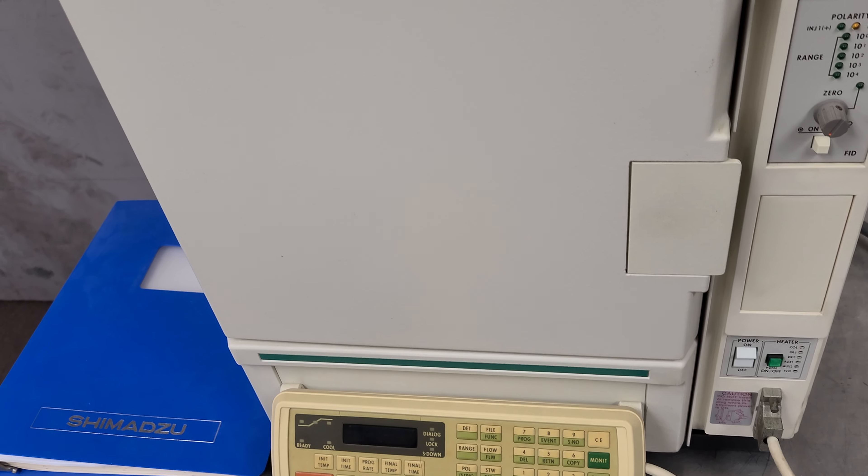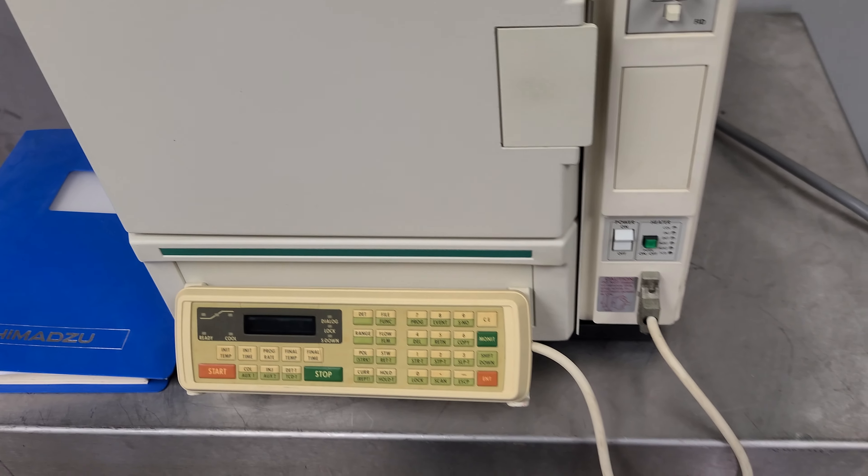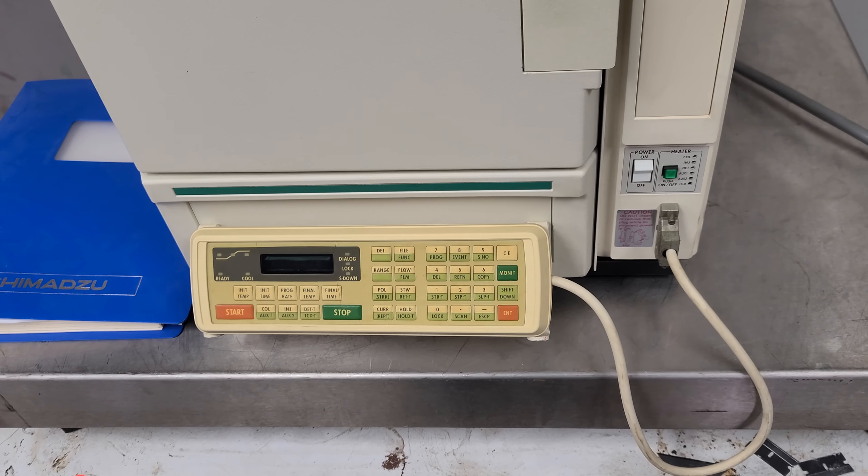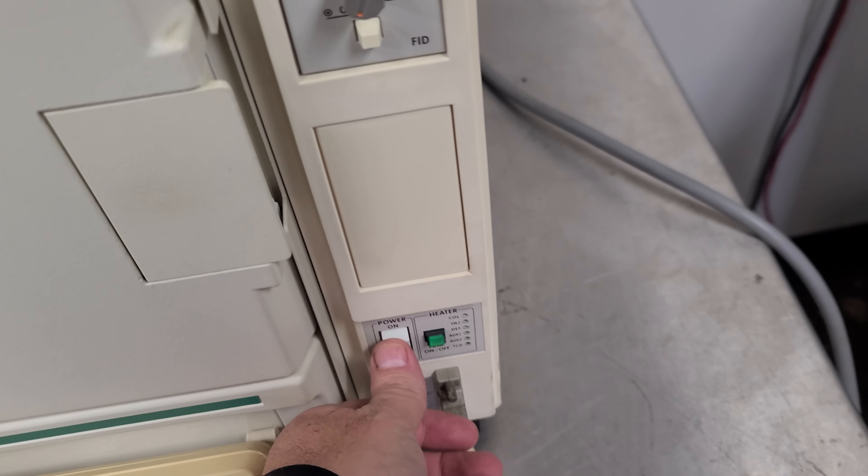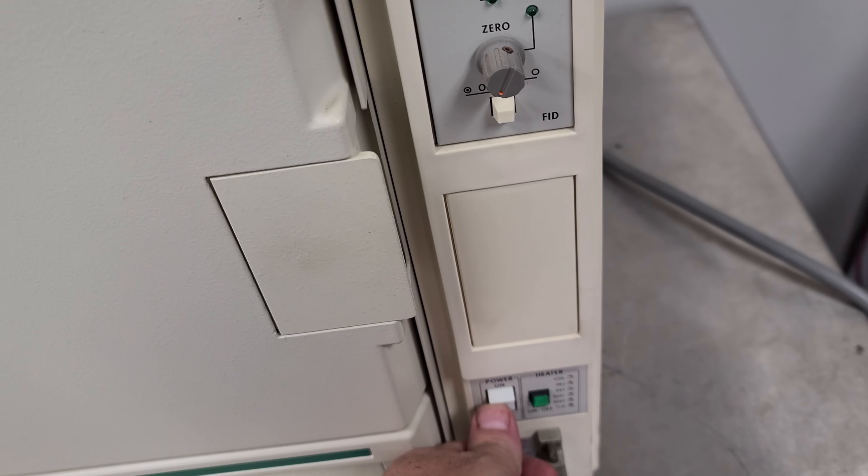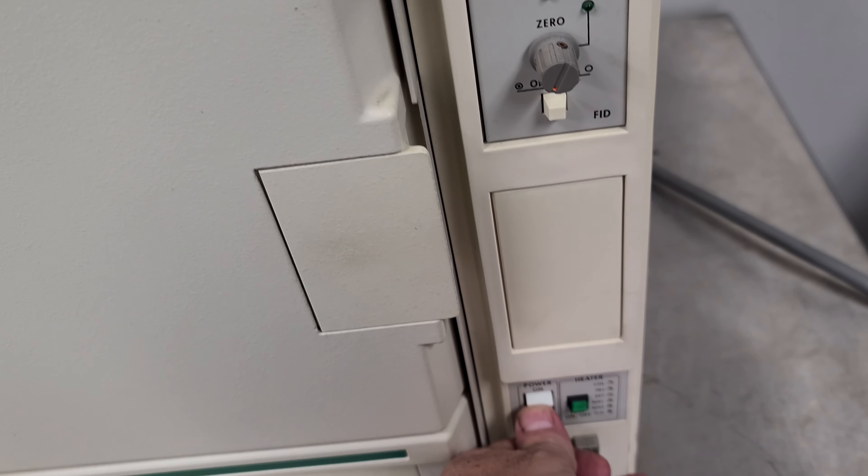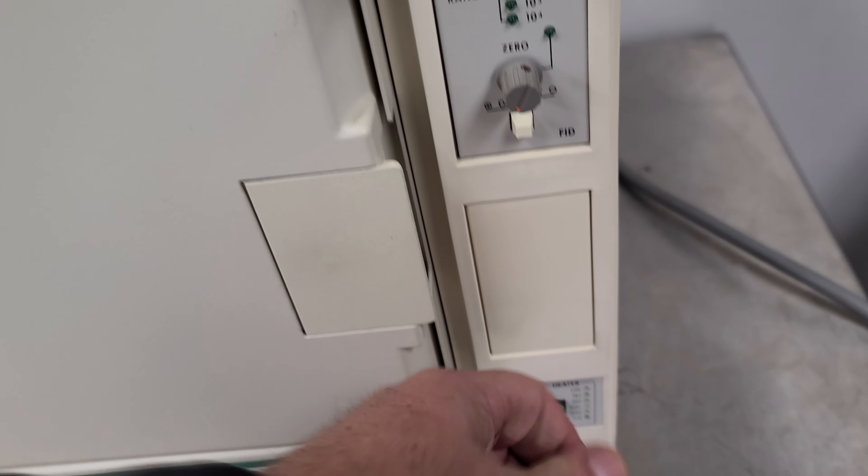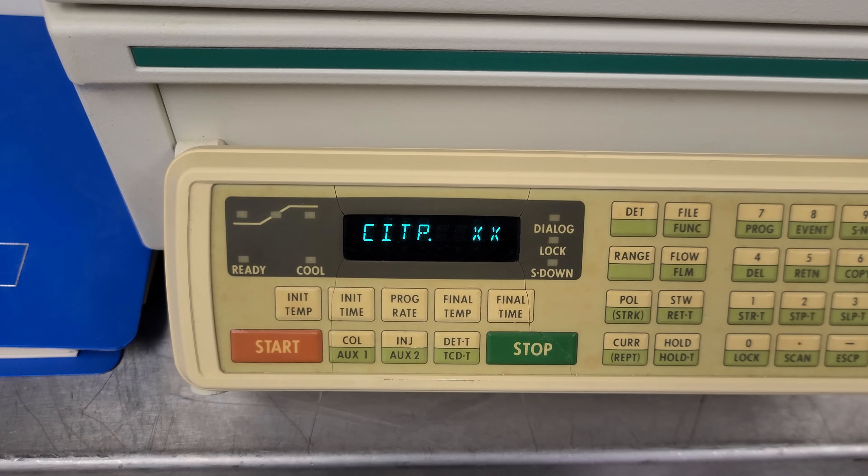Currently powered up, it is 115 volt single phase, plugged into a 20 amp circuit. It should be noted it's got the weird plug, but let's see this thing powered up.